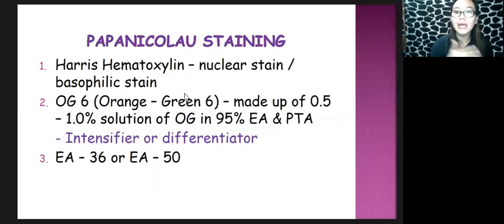After bringing slides to water, or after hydration, the next thing you have to perform is to dip it into your Harris hematoxylin. Again, this is a basophilic stain, which means it will stain basophilic structures. In particular, Harris hematoxylin is a primary stain that will stain your nucleus, as well as the different structures found in the nucleus.